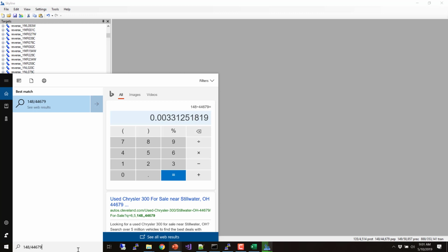Right? So less than 1%. That should make us happy. We were a little bit more restrictive than the paper, right? I think if you did everything the paper said, you would have over 1%, I believe like a 2% false discovery rate at the unique peptide level.